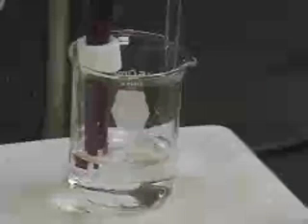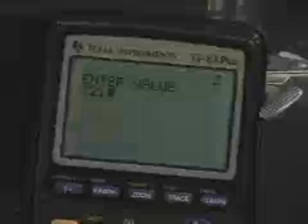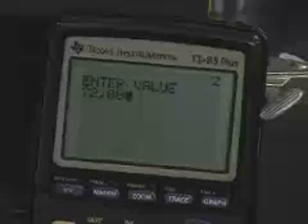We will now add 2 milliliters of sodium hydroxide solution. We want to read the burette carefully. If you don't add exactly 2.00 milliliters, read the volume carefully from the burette — that will be the volume that you enter. When the CBL reading is stable, we'll press trigger on the CBL and enter the volume on the calculator: 2.00.